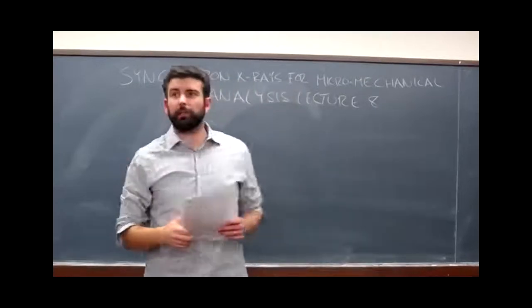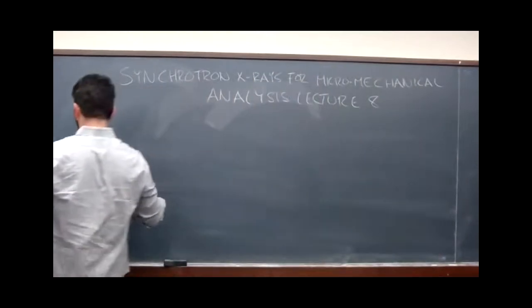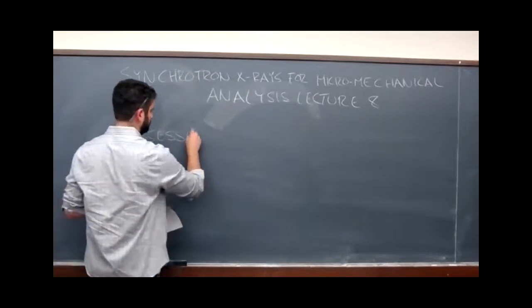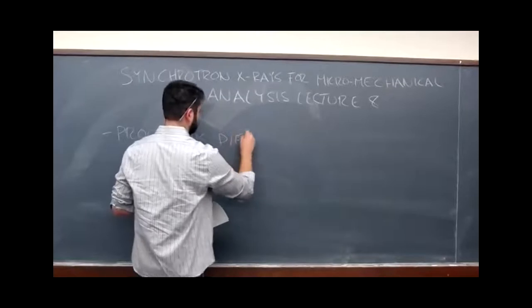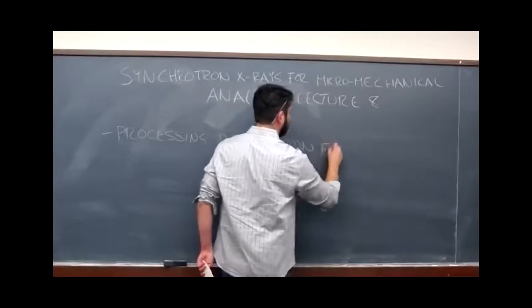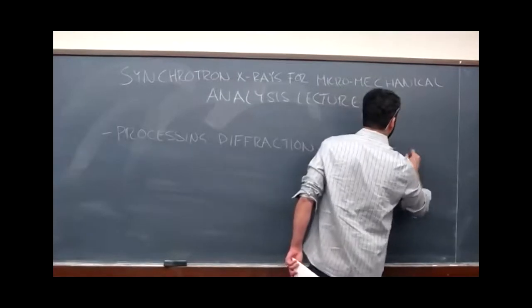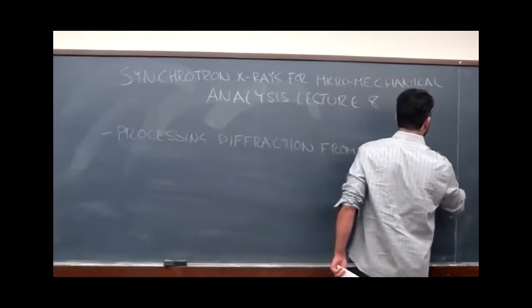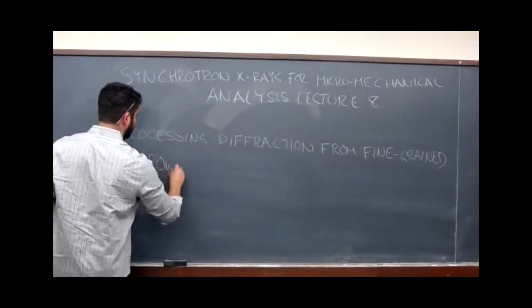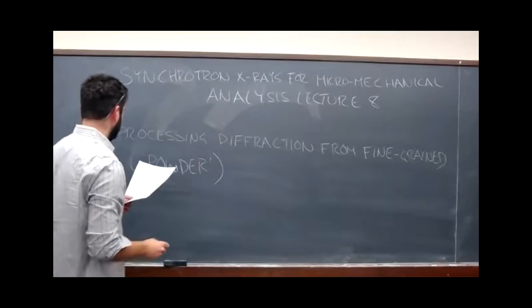This will be the final lecture of this current course, and today we're going to be talking about processing diffraction data, fine-grained, sometimes called powder, even though the samples might not necessarily be powder.